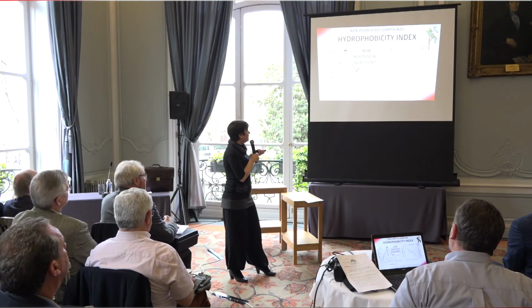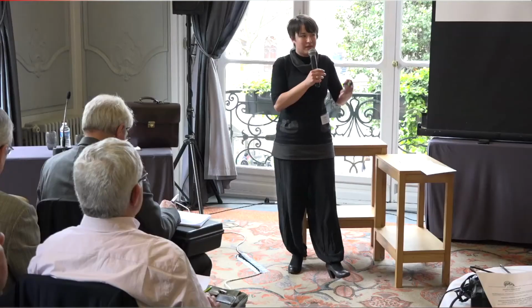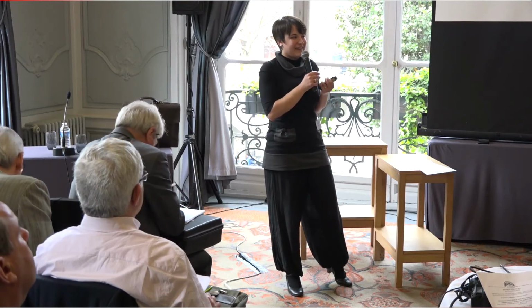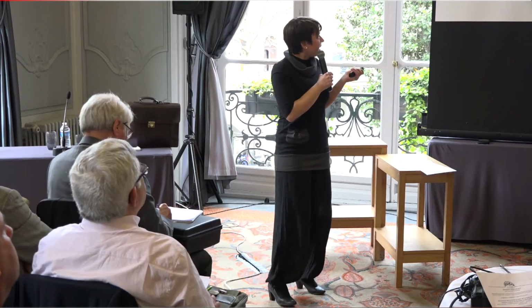And what we did, for example, is to study the hydrophobicity of the woody tissues by a reaction with Sudan IV, which is a red dye that interacts by hydrophobic interactions with hydrophobic compounds. So the more hydrophobic compounds I have in my tissue, the more red color is retained in the tissue.